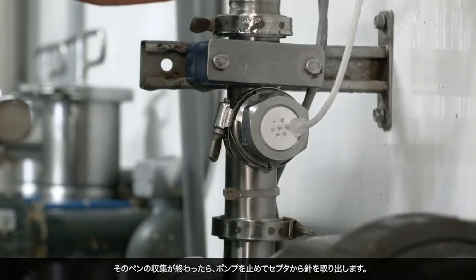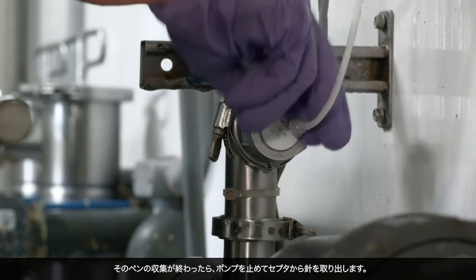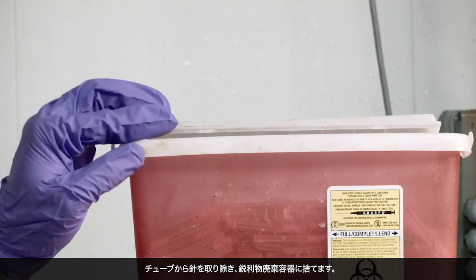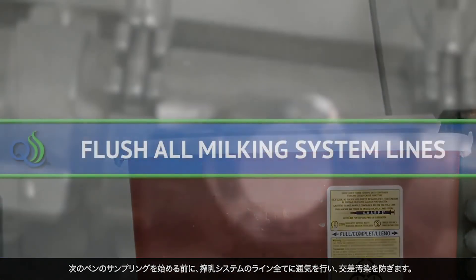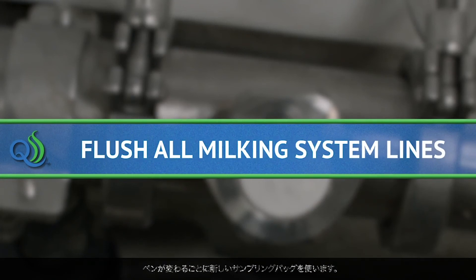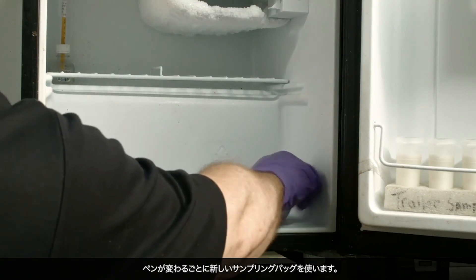At the end of each pen, stop the pump and remove the needle from the septum. Remove the needle from the tubing and discard in a sharps container. Before beginning sampling of the next pen, flush all the milking system lines by an air blow to avoid cross-contamination. Use a new collection bag for each pen.